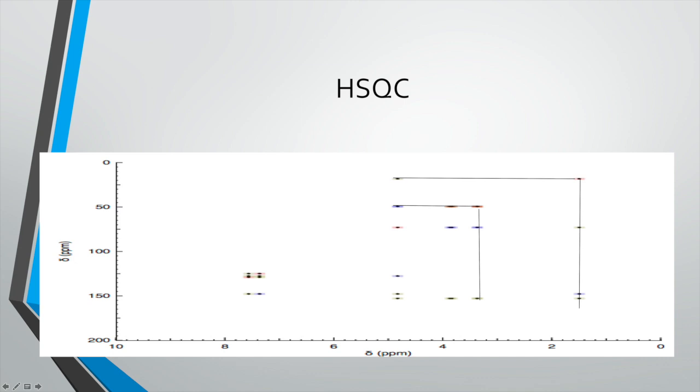From the lines drawn on the HSQC, you can see that the carbon located at 18.3, the only CH3 in the molecule, interacts with the proton near 4.83 ppm, and you can see that the two carbons that are located at 50 ppm interact with the protons that are located in the 3.4 ppm range and 3.9 ppm range.